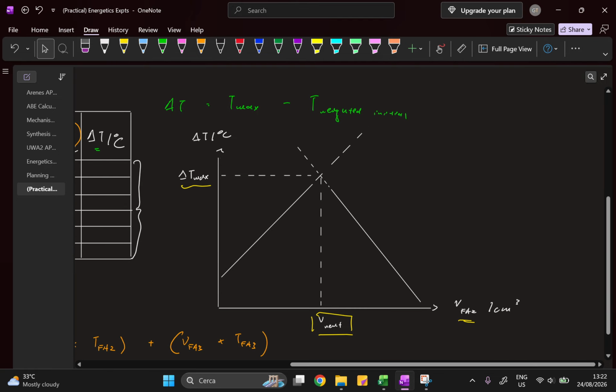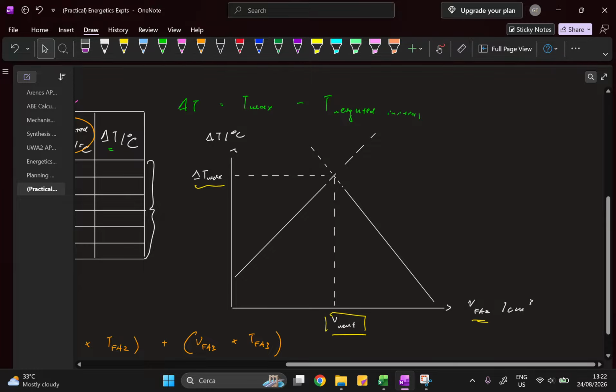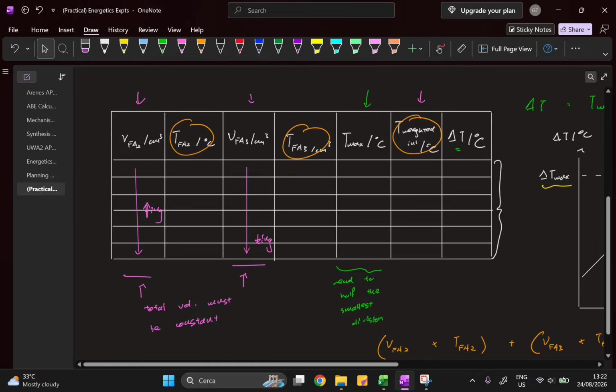But in this case, do you see how this is getting us to the same idea as conventional titration, where you add more and more of the known solution from the burette? Then after that, you find the neutralization point, and this volume that you get in the burette reading table is the volume of the thing that has known concentration already. Then the thing in the conical flask is your unknown. You get how it's a similar idea here.